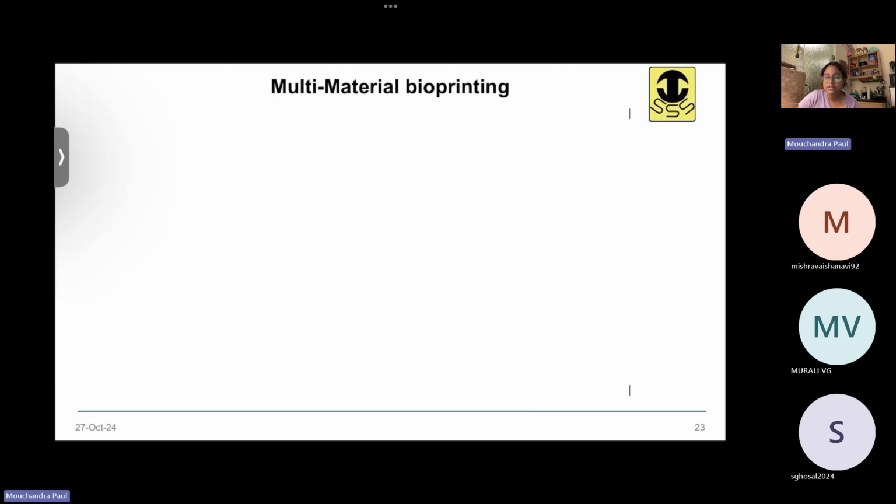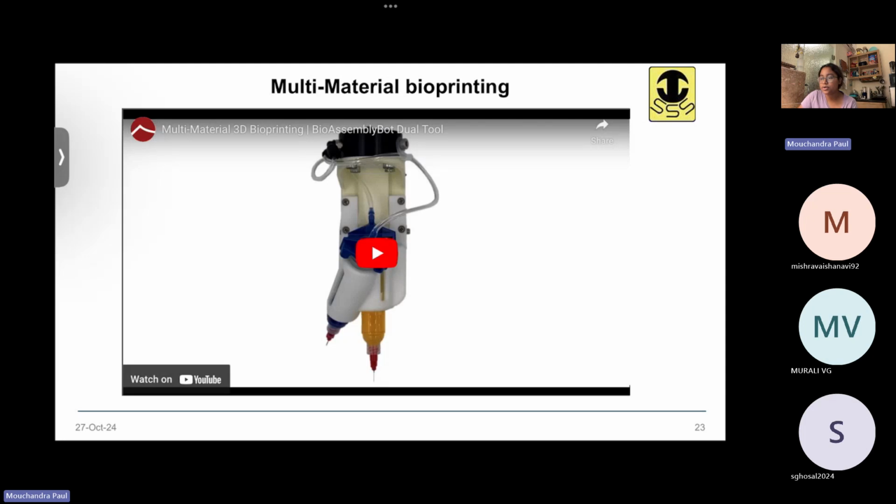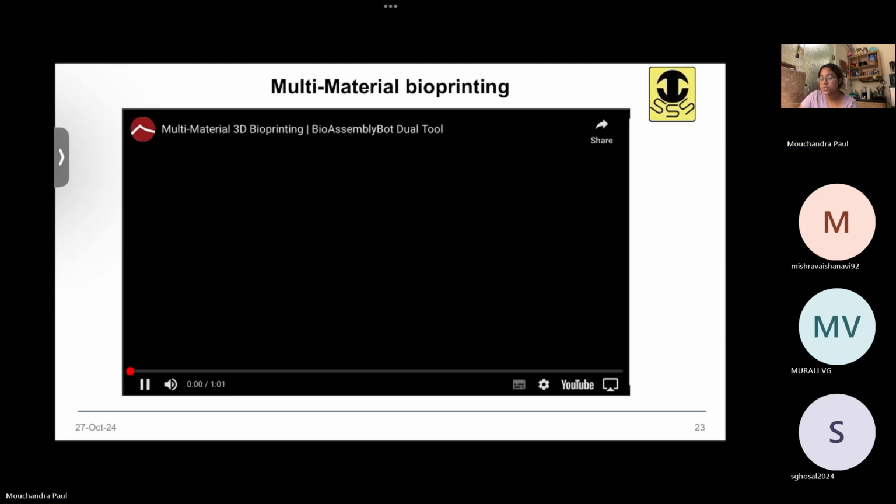So there's a demo video that I have for you guys of how they are doing multi-material 3D bioprinting.